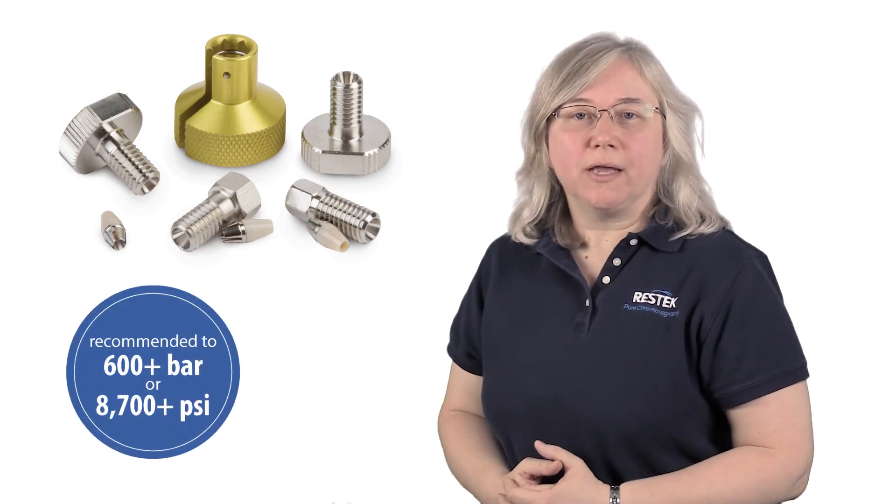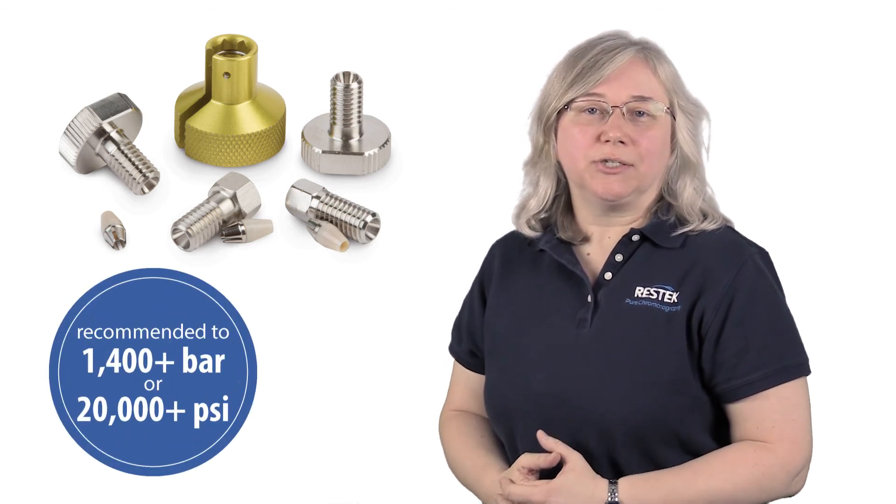And for stainless steel tubing, especially on a guard or an analytical column connection, the EXP fitting system is recommended. These are hand-tight to 9,000 PSI and wrench-tight to 20,000.